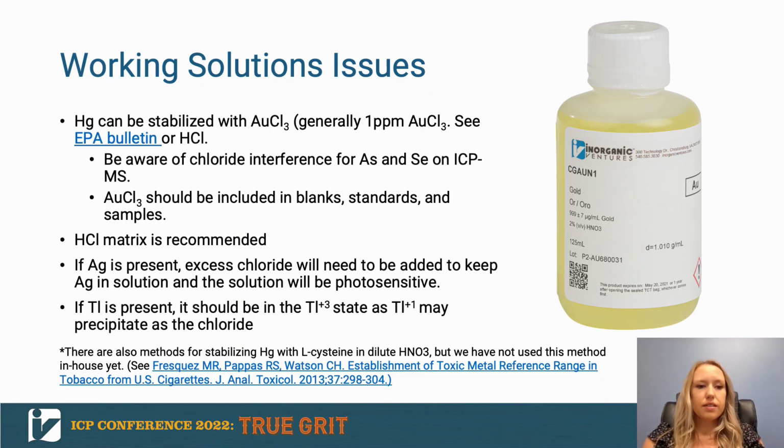Another issue is with thallium. So if you have thallium in the +1 oxidation state, it will precipitate with any chloride. So you want to make sure that you're using thallium +3 if you're mixing that with any chloride source.